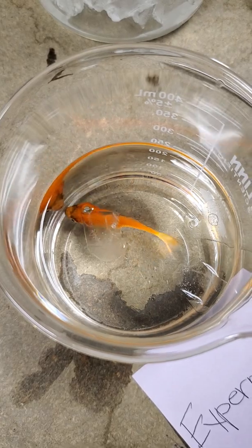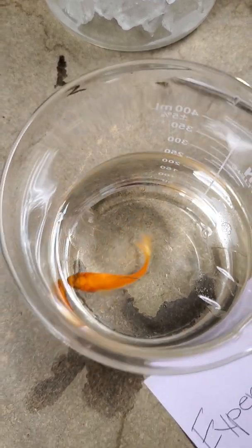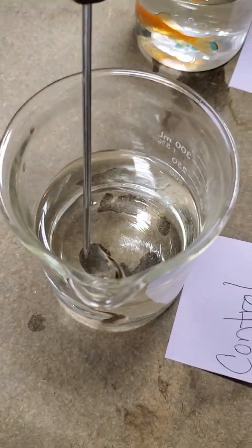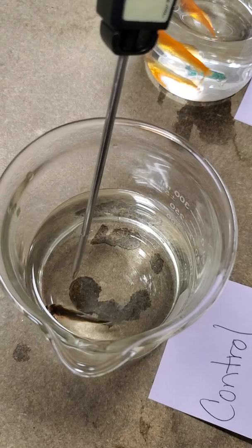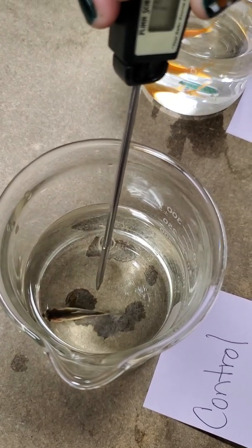And time. Okay, now we are going to go back to our control goldfish, and we are going to get the temperature once more. It probably won't change that much.